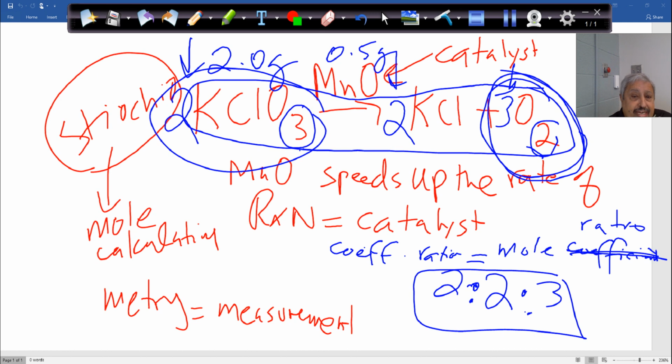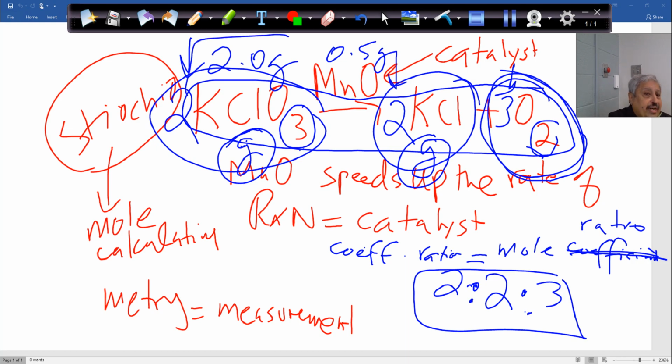So I can go back and calculate how much potassium chloride is left in grams out of this decomposition, how much of the chloride came as a product from the decomposition. With knowing this, whatever grams came out from the oxygen, whatever came out from potassium chloride, I divide by the whole number I started with, multiply by 100, and that gives me what?